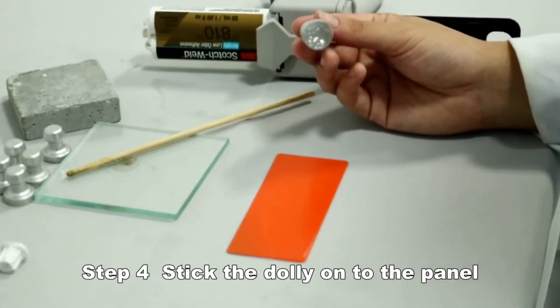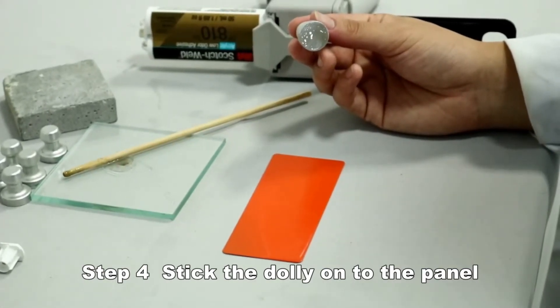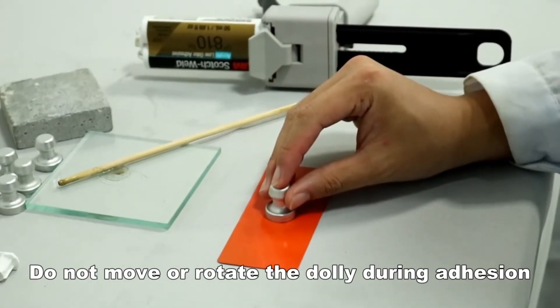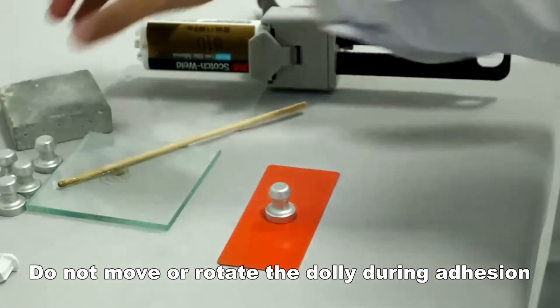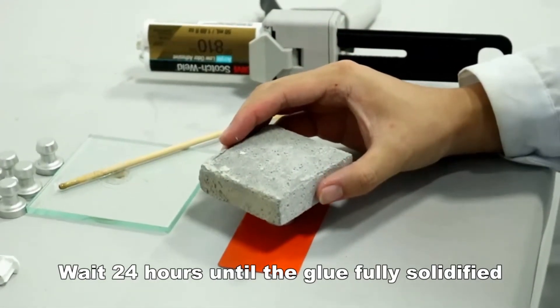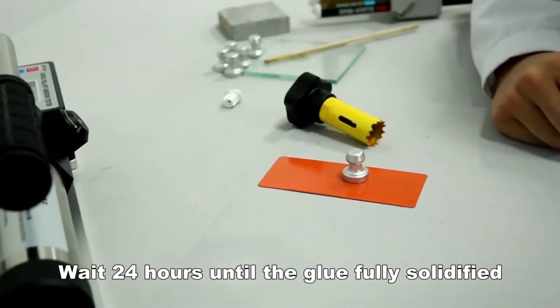Stick the dolly onto the panel. Press the dolly vertically. Do not move or rotate the dolly during adhesion. It is suggested to use a chunk to press it. Wait 24 hours until the glue is fully solidified.